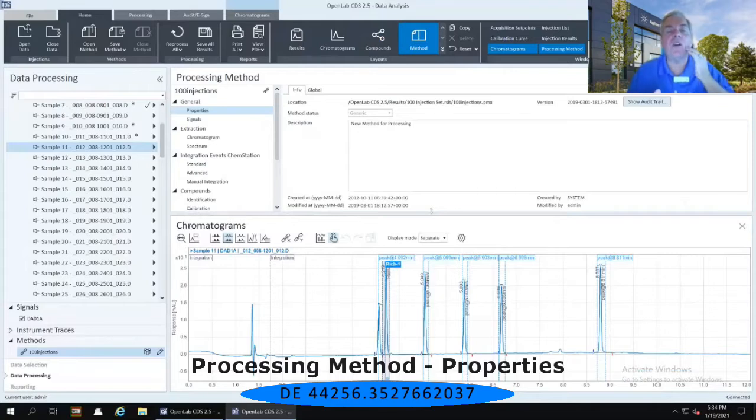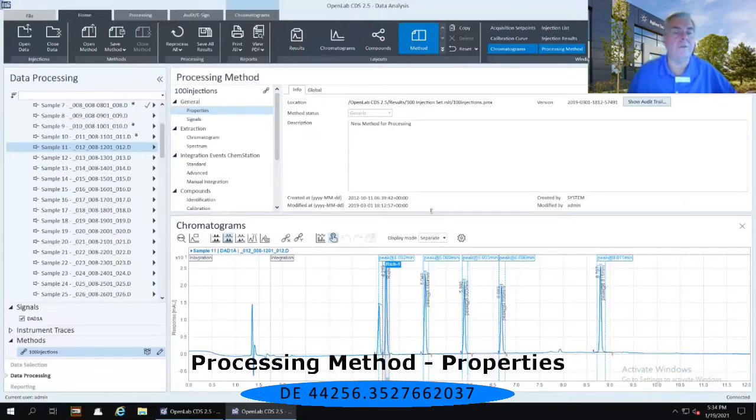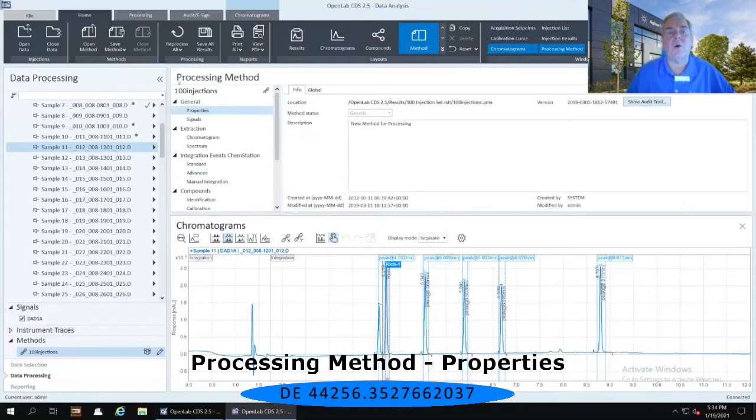So this very first icon underneath the 100 injections in that top or in the right-hand panel where it says processing method and then 100 injections, and immediately below that there is a general and then properties.